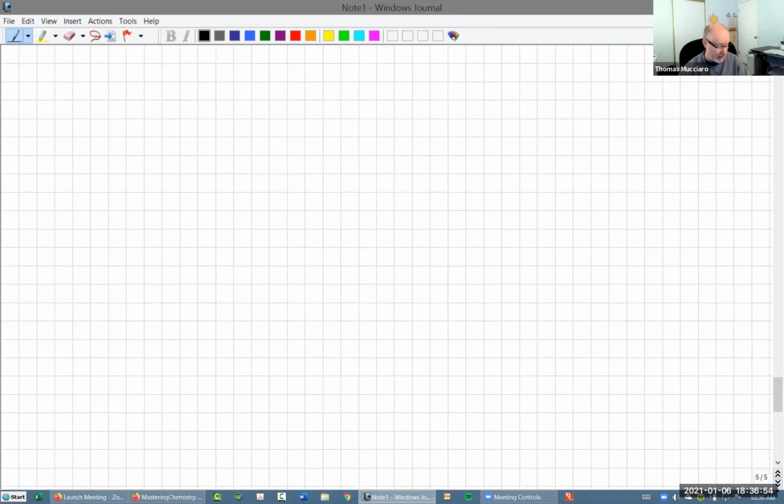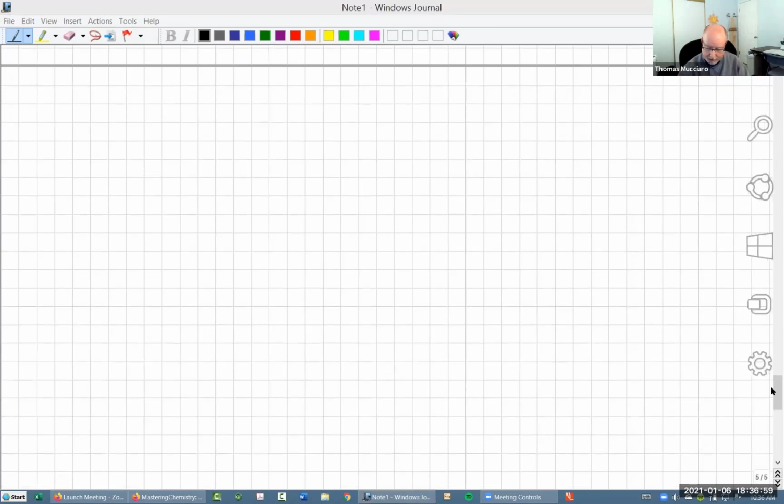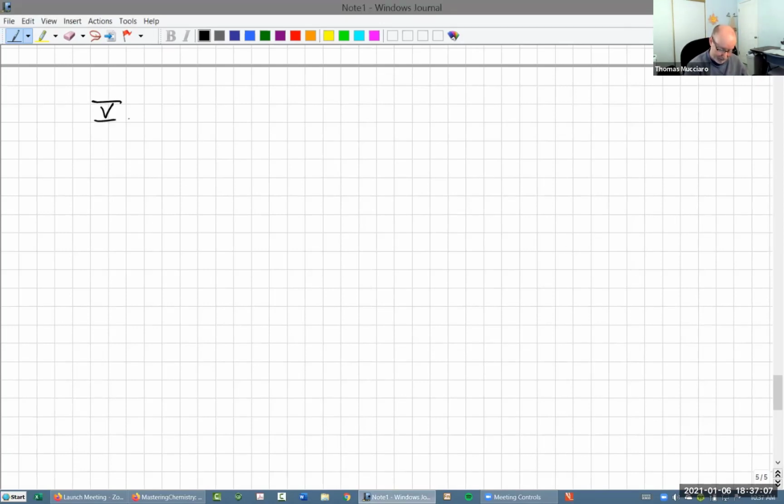Okay. Last thing, you guys are super patient. I totally appreciate it. I'm sure you guys are getting totally bored by now, but I've got good news for you. So, okay. Last thing, peak splitting. Today, we are going to do the simple explanation of peak splitting, okay? Now, I have a really straightforward way for you to visualize and use the language of peak splitting, okay? So trust me.